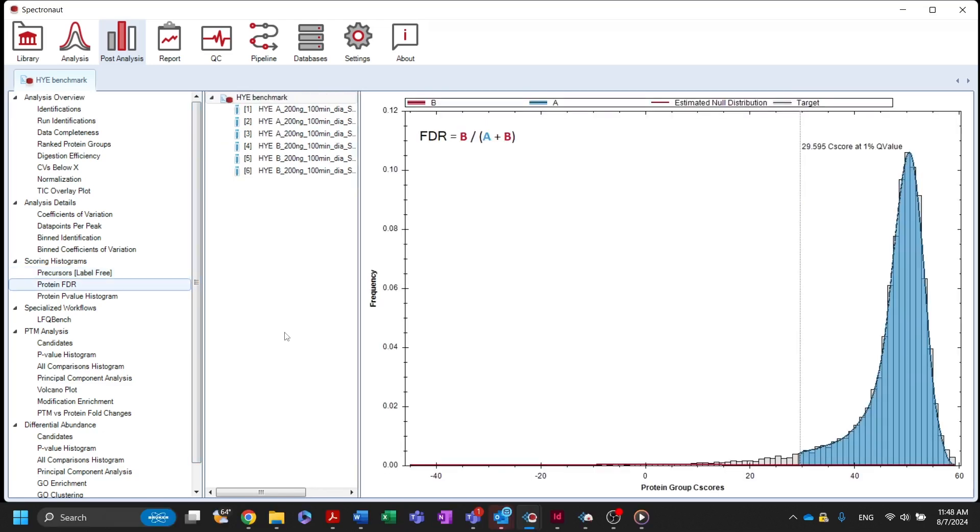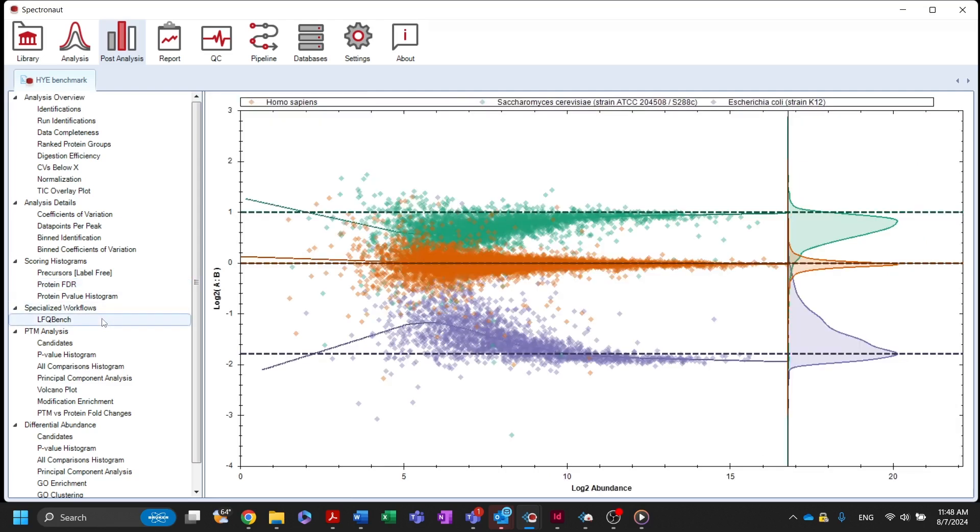Under the specialized workflow section, Spectronaut features a dedicated LFQ benchmark plot for benchmark experiments involving mixed-species samples. This plot will be automatically generated if more than one species is detected in the selected FASTA files.